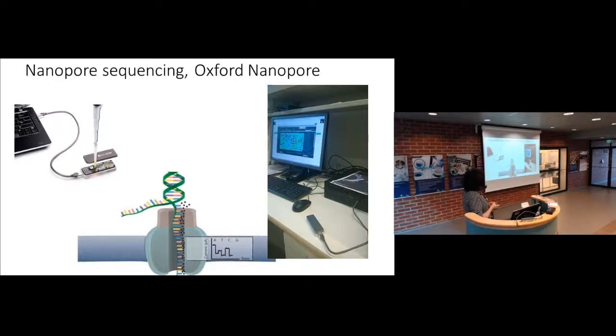It's not that high throughput yet, so typically we get 400 million reads from every Illumina run, and this gives only maybe 500,000 sequences per run, but they are longer. It still makes many more sequencing errors, but for us, we don't even want to sequence the whole human genome.